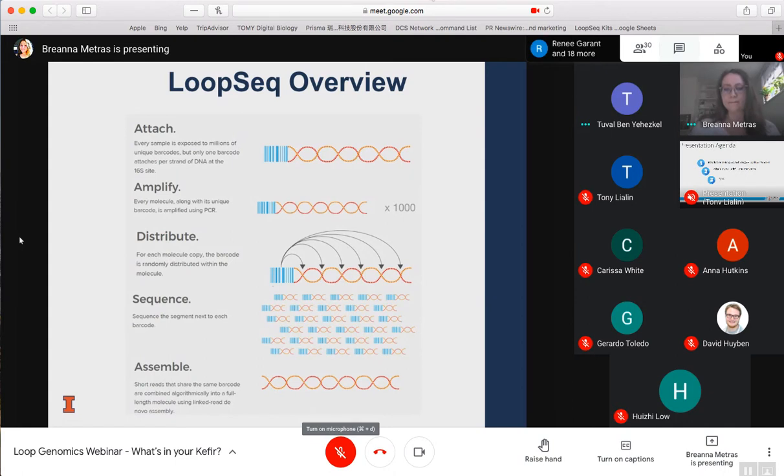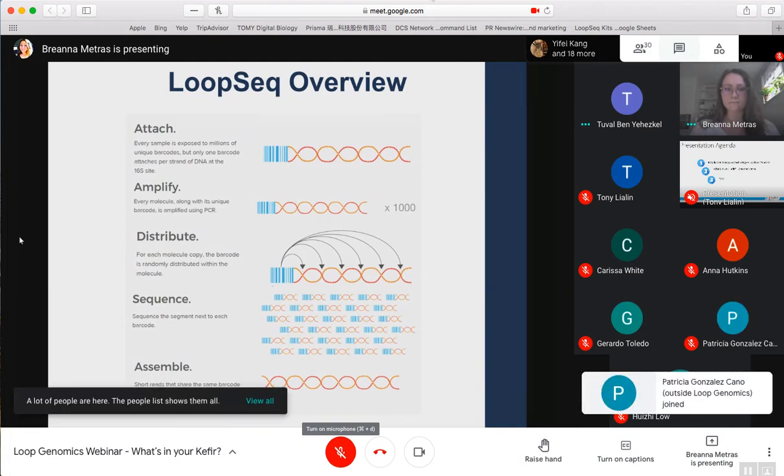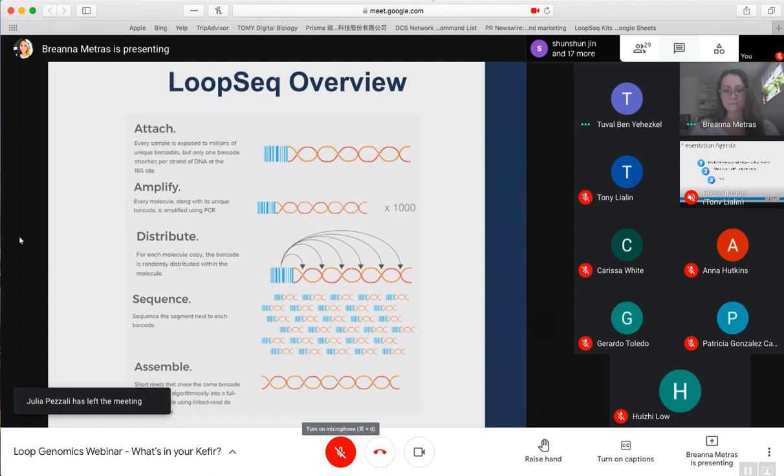And that raw long read data is the data that Brianna used in order to classify and quantify the microbial composition in her samples. I should mention that this is a specific application of LoopSeq technology to full-length single molecule long read 16S sequencing, but the exact same chemistry can be, and is, used to sequence any long molecule, DNA or RNA. We have multiple applications for sequencing different types of amplicons from the microbiome and not from the microbiome, sequencing genomes and transcriptomes. So this is a general purpose long read chemistry that can be used to sequence any long DNA or RNA molecule. And the presentation that Brianna is going to present now shows one very interesting application of using this technology for 16S sequencing for characterizing dairy products. So Brianna, take it away.